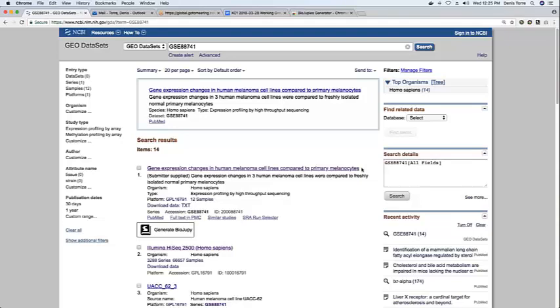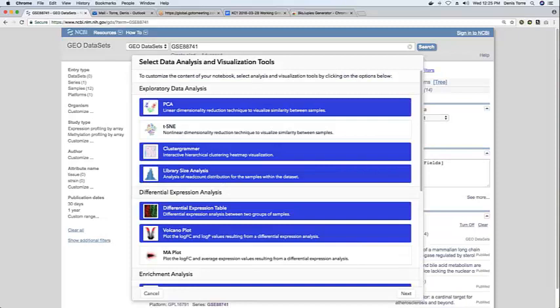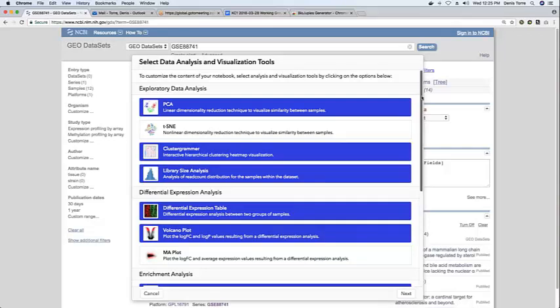And so the Chrome extension adds this button below the search results that users can click on. And this allows users with little to no computational knowledge to start generating a customized analysis notebook of the dataset.